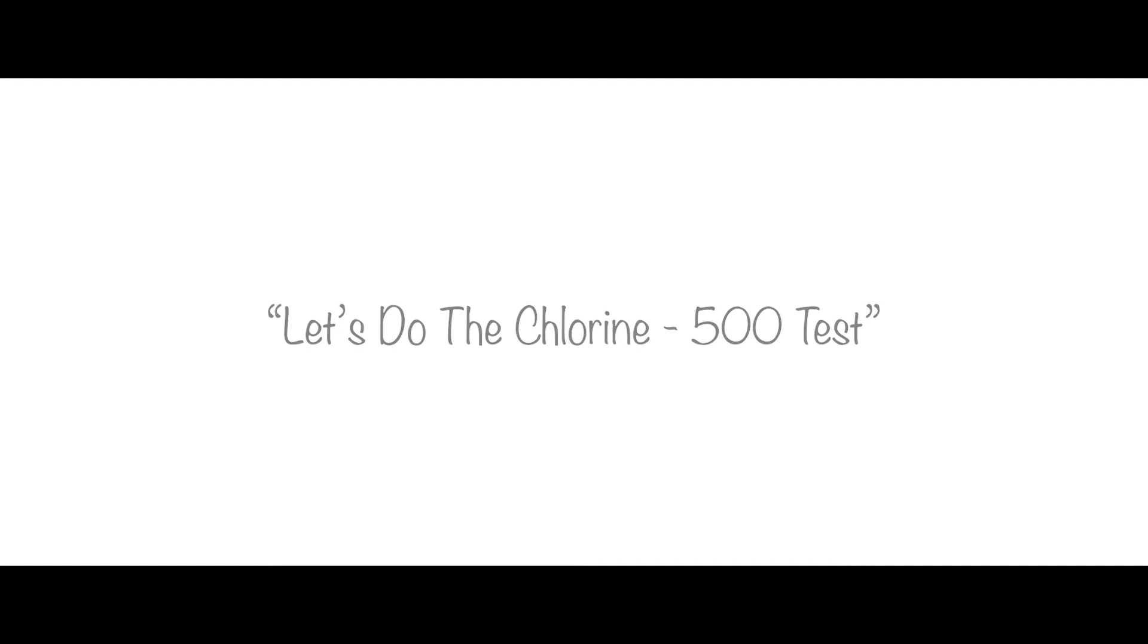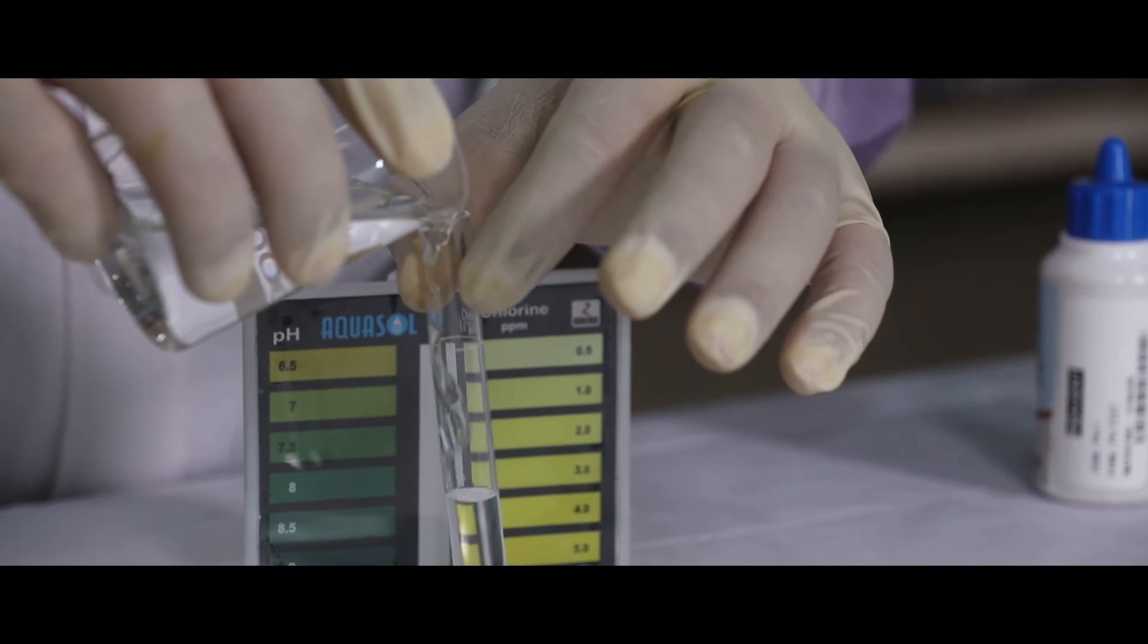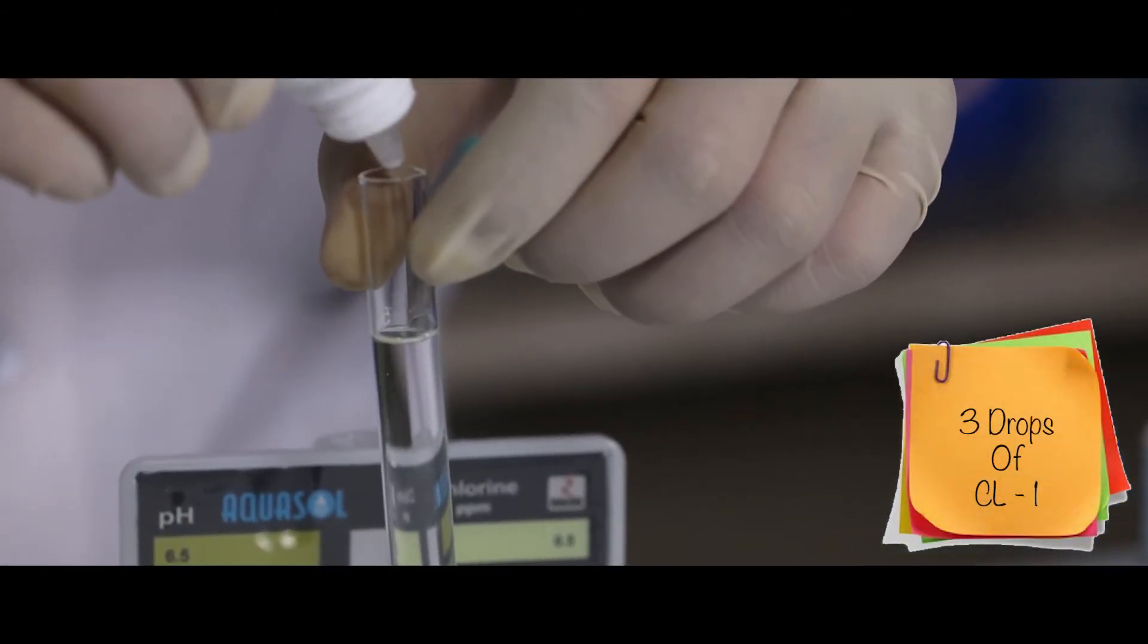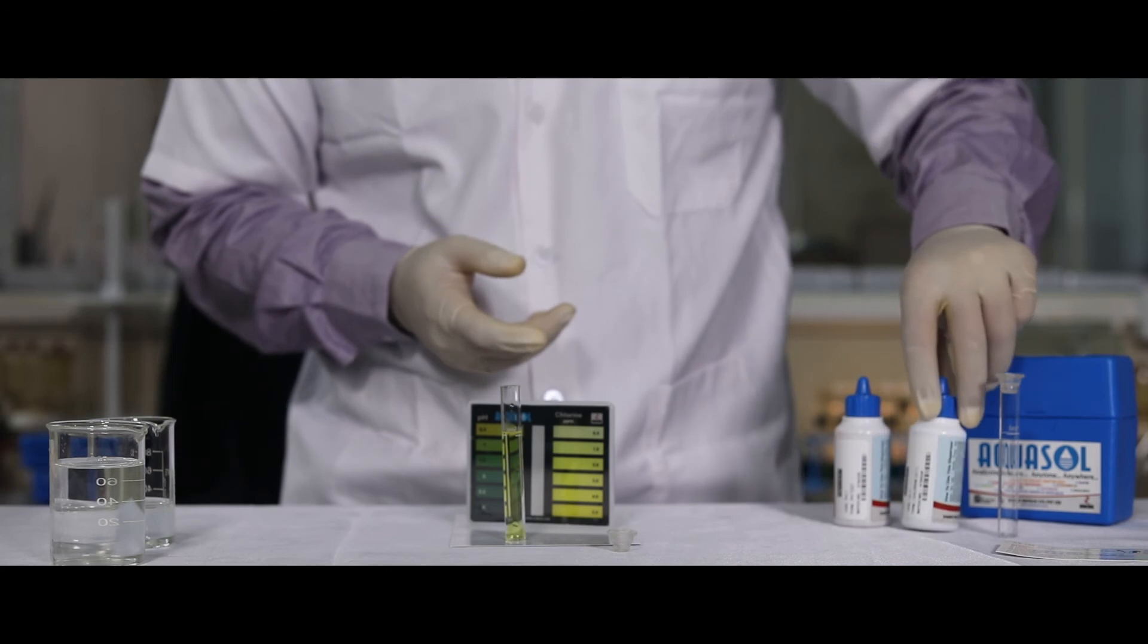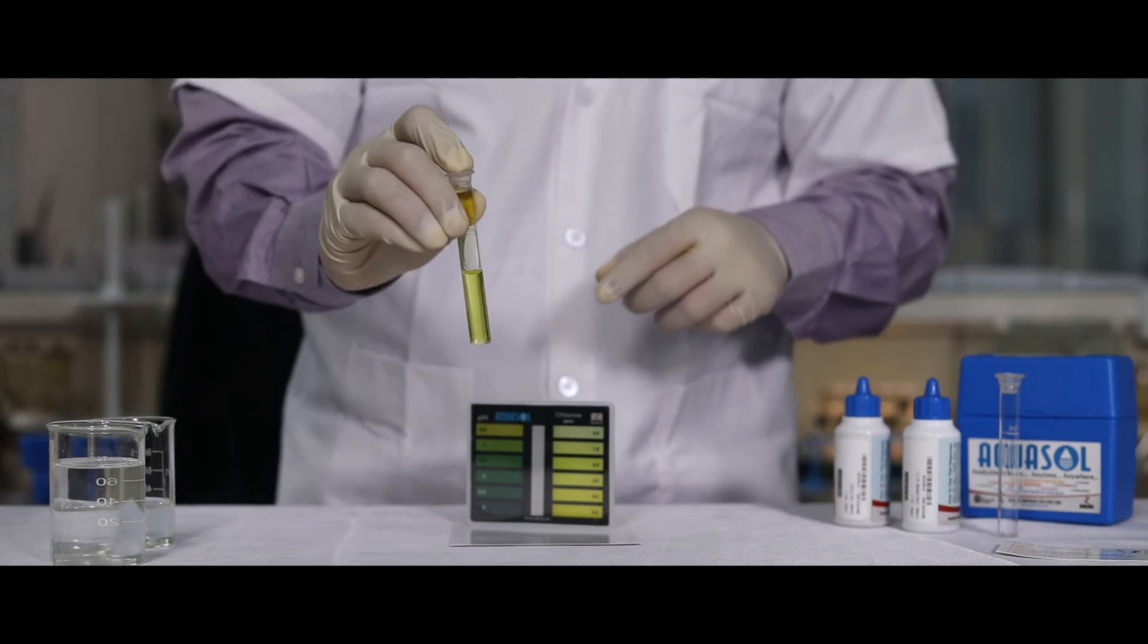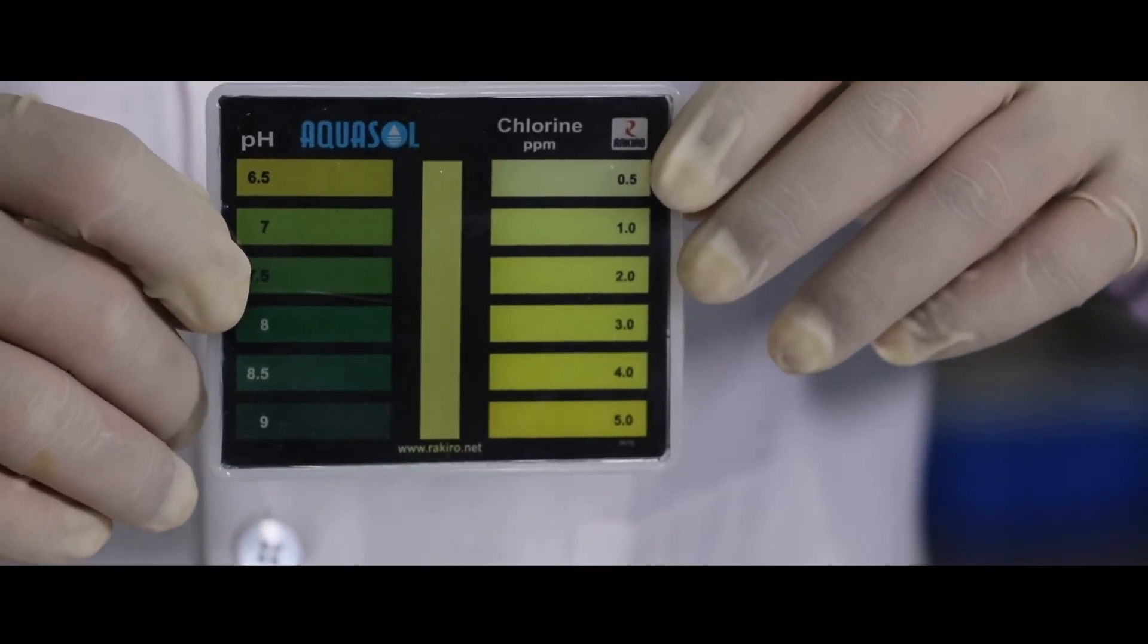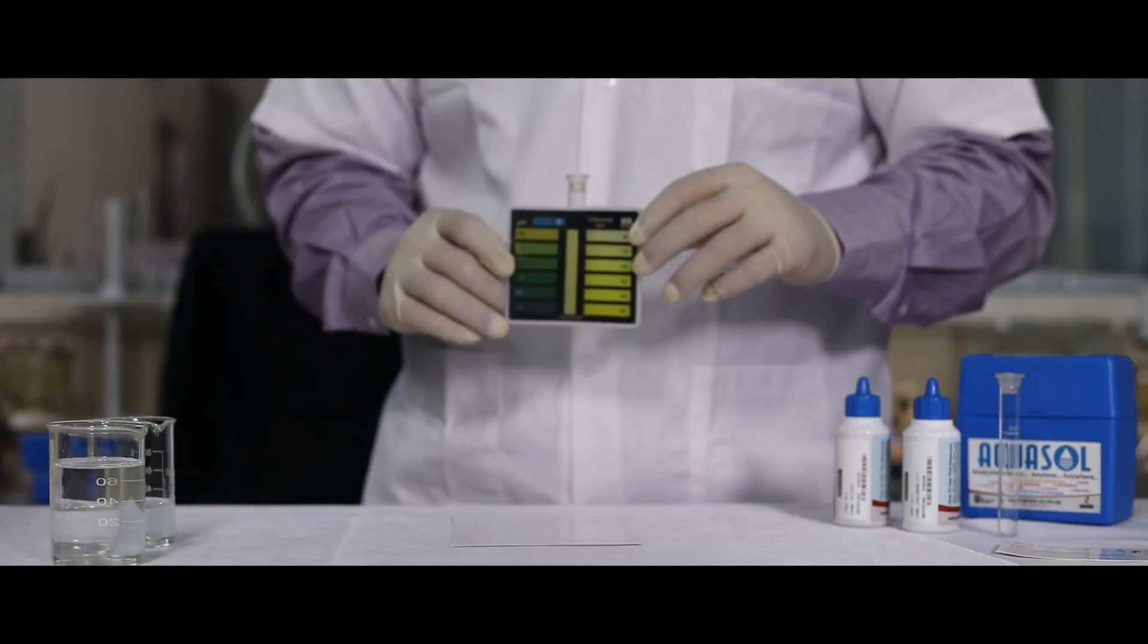For chlorine testing, fill the test tube with the sample till the mark and add 3 drops of chlorine Cl-1 reagent. Mix well. Place the test jar in the comparator slot and match the color to the color chart to know the value of chlorine present in the sample.